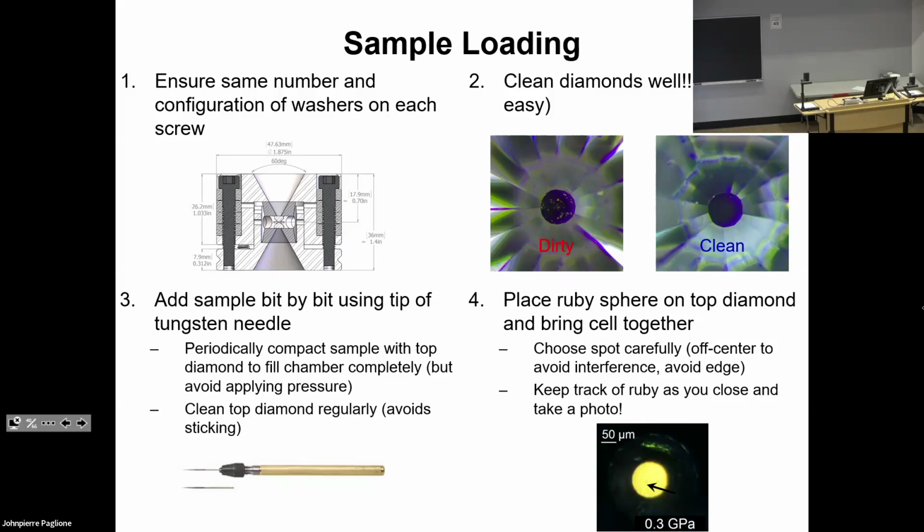Okay, so loading is a real challenge, but really important. So first, you would ensure you have all the right configuration, and then take time cleaning off your diamonds. So this is what a dirty diamond looks like, and it's got all of that stuff on there that might be from your Q-tip or something like that. So it takes practice to do just one clean swipe of a Q-tip and then get it to something where the face is nice and clean. Then what you're really doing is loading in sample bit by bit with a needle tip. And so that takes time, and maybe don't drink too much coffee. Maybe we'd all be good at it right now.